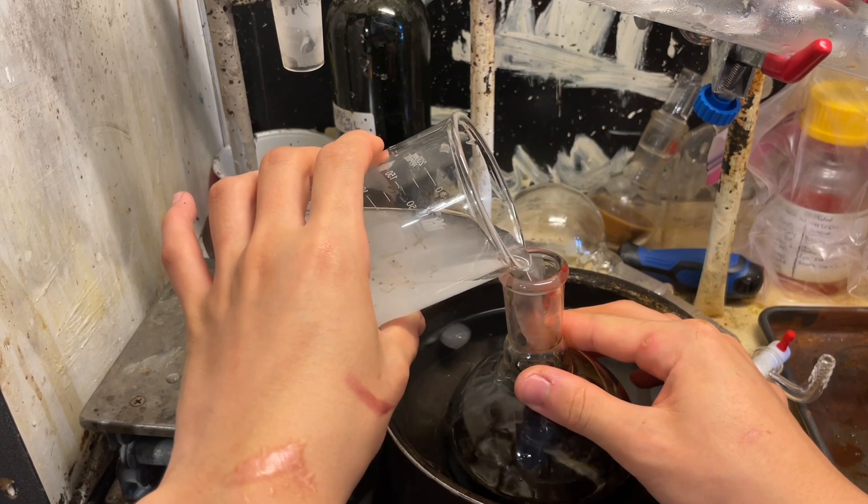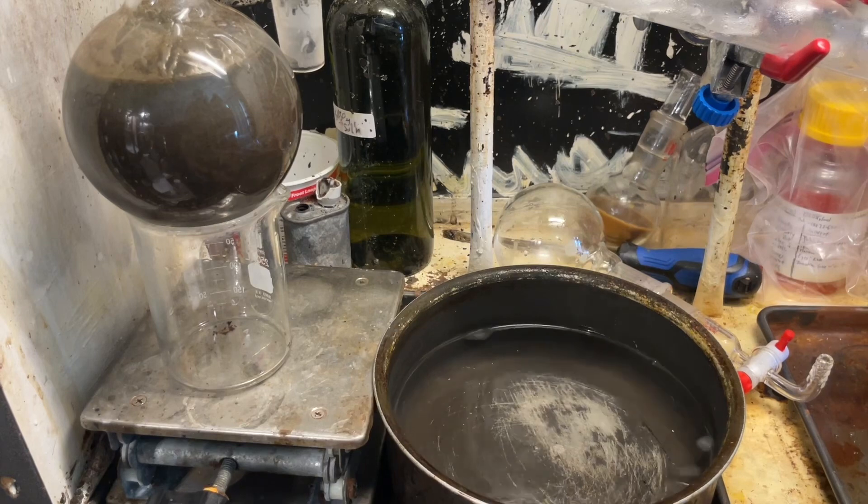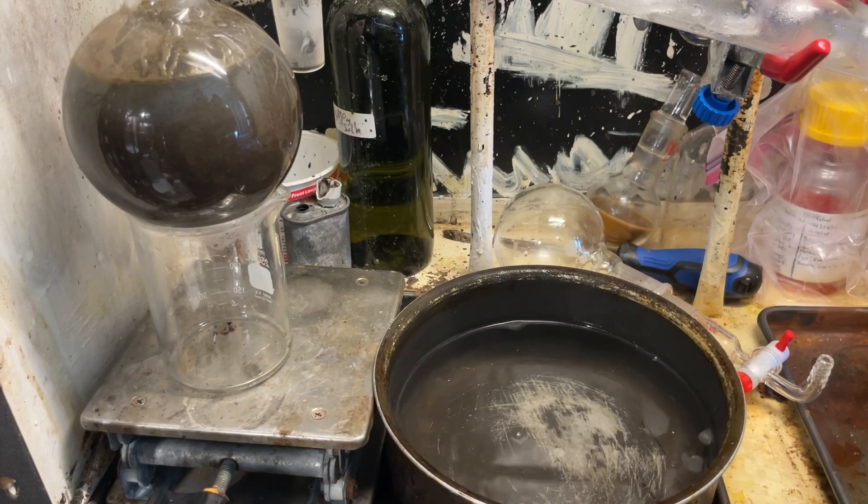That's not too bad. I also refuse to heat hot caustic in my flasks unless it's one that has already been etched. So I'm going to use one that's already etched.